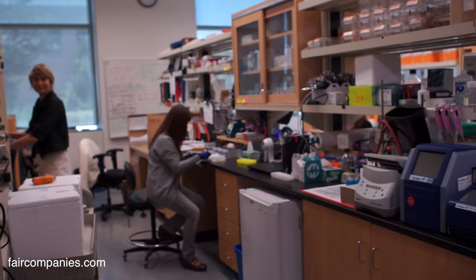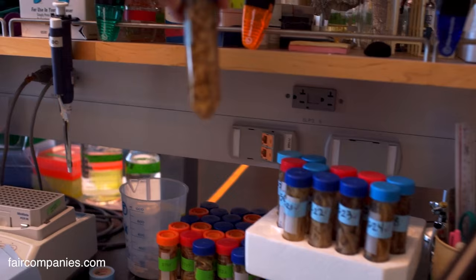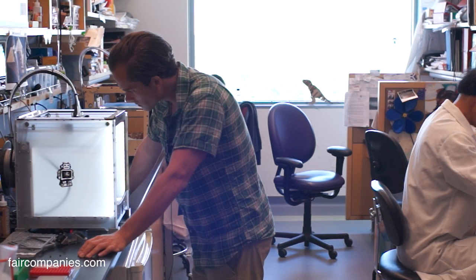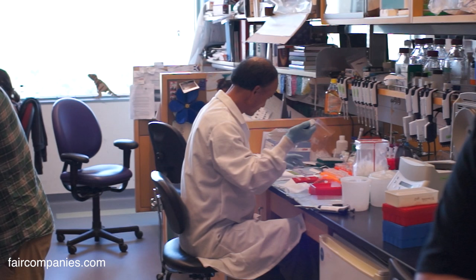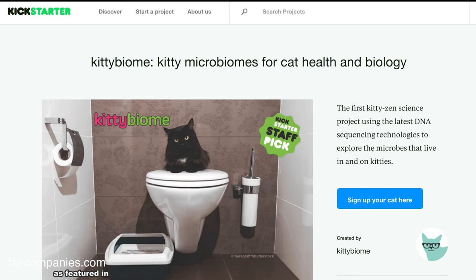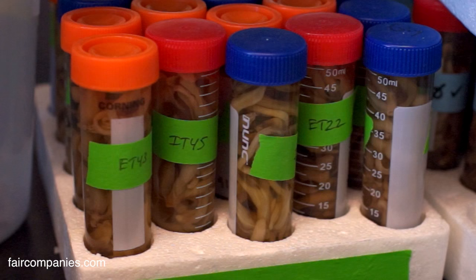She helps run the system here. These are, looks like, seagrass samples, so we're doing studies of seagrass. We're interested in the general rules by which microbial communities interact with each other or interact with a host, like a plant or an animal. And what we're interested in is comparing lots of systems to each other. You know, Sonia over there is interested in amphibians and the microbes that live in and on them, and we have people working on cats, and we had a Kickstarter campaign on the kitten microbiome, and we have people working on grapes and corn and rice and koalas and seagrass.